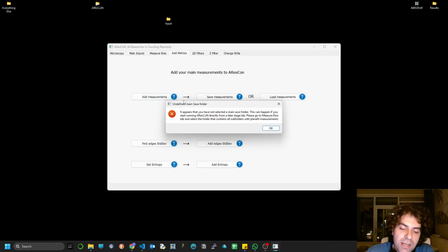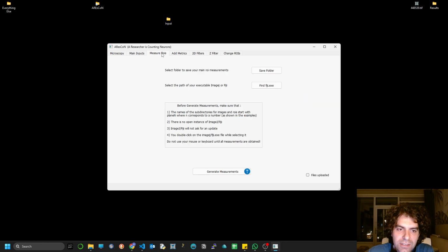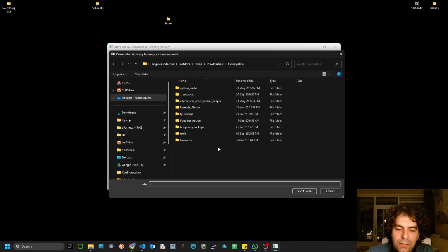You will be asked to indicate again some of the folders. So let's start by selecting the main save folder. Normally you wouldn't get that, but I actually closed it myself. You never saw it in the video, but I closed it myself and I opened it. So let's click OK, and let's indicate the main save folder.